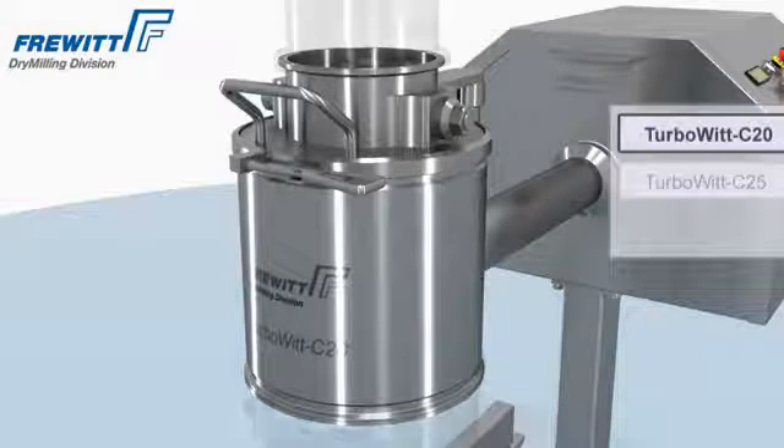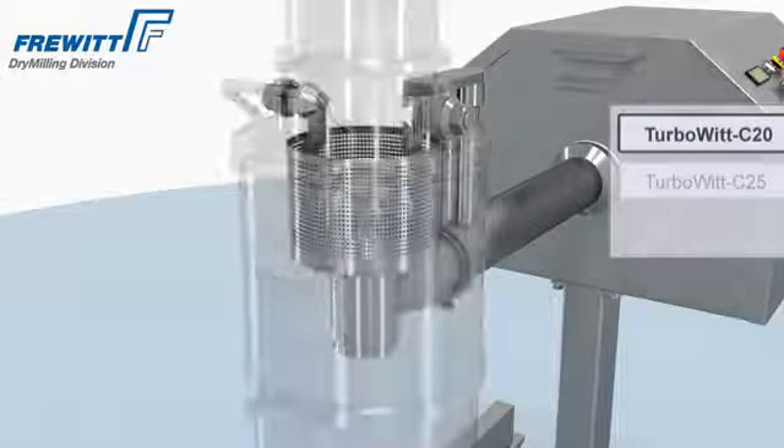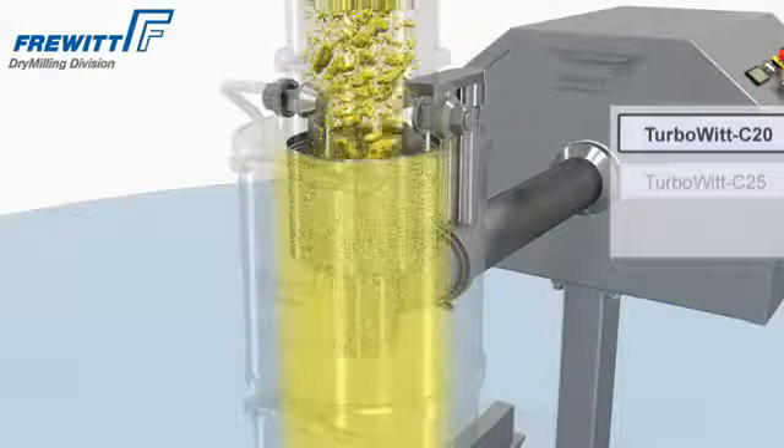The newly developed TurboVit is a unique system due to the rotating sift drum. In combination with a fixed stator, the TurboVit disagglomerates the product exceptionally gently.